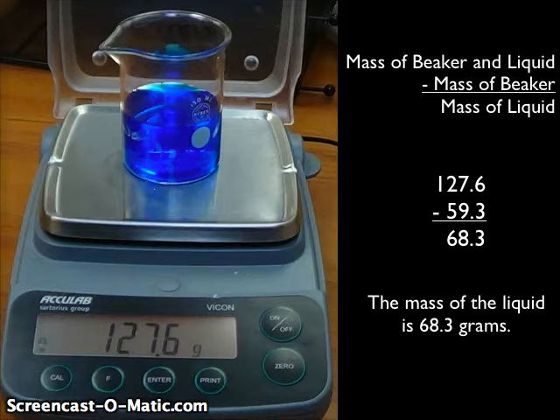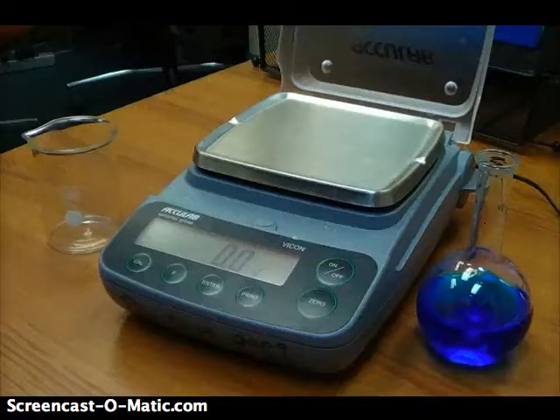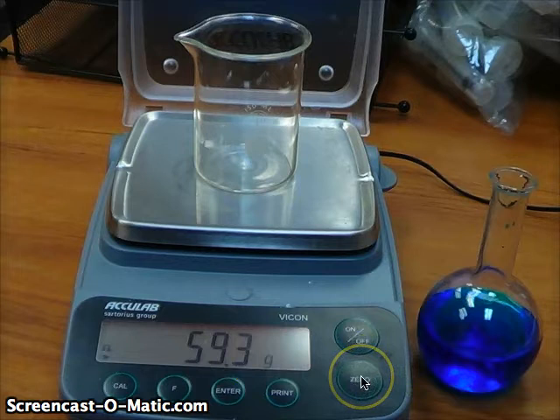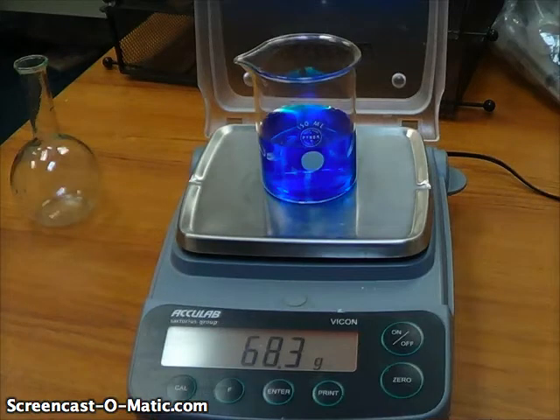A second way to find the mass of the liquid is by using the zero button on the balance. In order to use this method, we're going to need a second beaker, just as before. We put this on the balance while it's empty — you can see 59.3 grams, just as before. Now we press the zero button on the front of the balance, which tells the balance to ignore the 59.3 grams from the beaker. The balance will now read zero. I can take that beaker off, add the liquid to it, and put it back on the balance, and the balance will only show me the mass of the liquid, which is 68.3 grams.